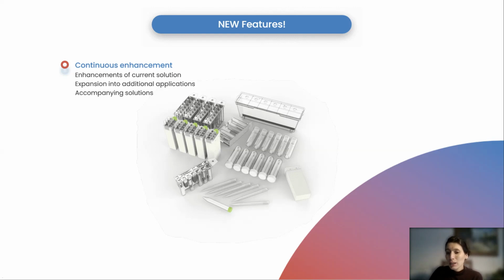So one of the big things is really optimizing our current solution. We're working right now on making that optimal range of bacterial pellet that I had mentioned earlier in the presentation, the 1 to 1.5 grams of bacterial pellet.